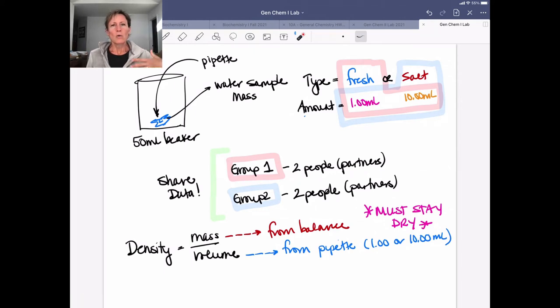Well, ultimately, if you know the mass of a substance and you know the volume that that substance is contained in, you can obtain the density. Because density is a relationship between the mass and the volume of some substance. And so we're going to use the balance to determine the mass of the substance. And using these very accurate volumetric pipettes, either one milliliter or 10 milliliter volumetric pipettes, we're going to very accurately determine the volume.